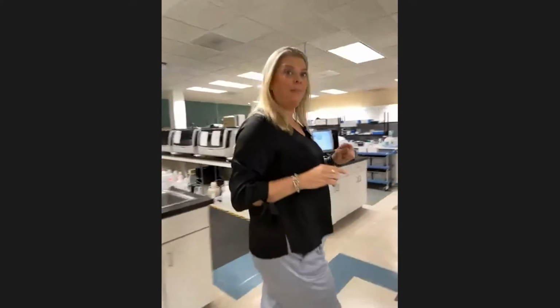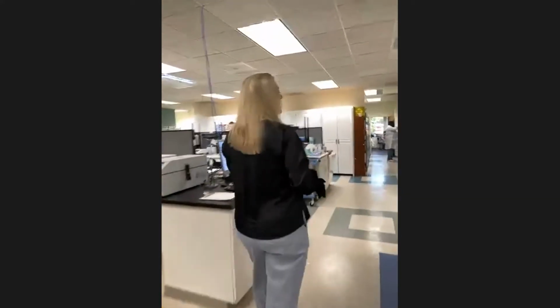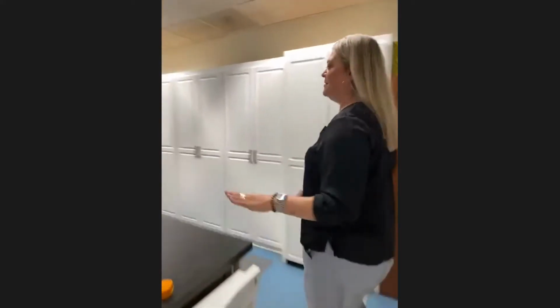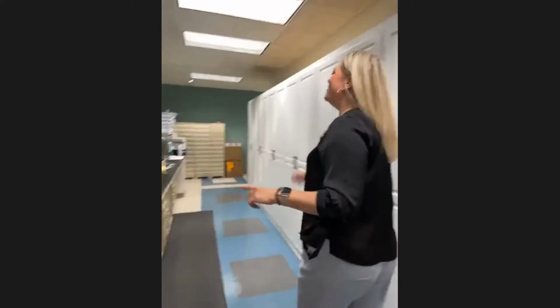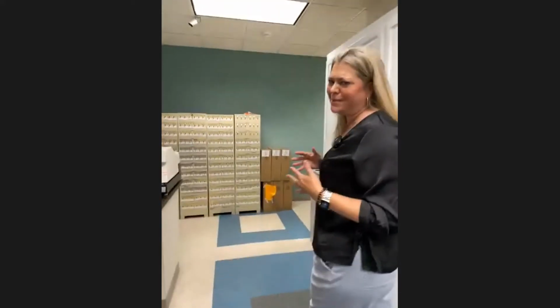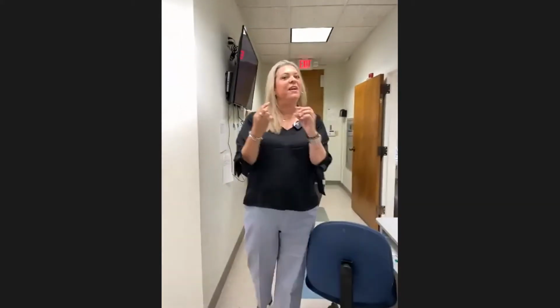We're going to take a walk back here to the back of our lab where we do our electron microscopy. So I'm walking backwards, so if I trip, this is part of the game. So here in electron microscopy, this is one of the coolest areas of what happens to your renal biopsy tissue. We deal with small pieces of tissue that are embedded in something. Back here, it's embedded in a resin, and it becomes a very small block.